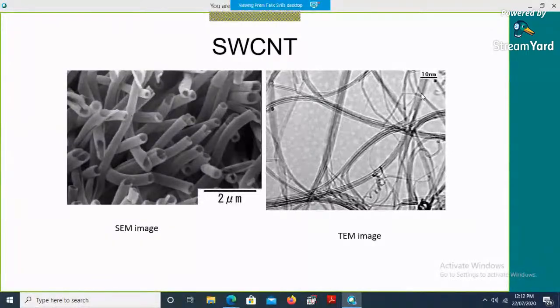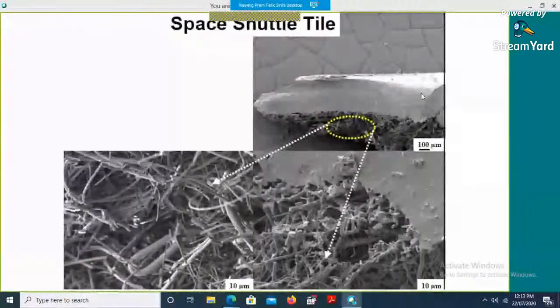So we have to make a judgment about what information we are looking for, and then use the appropriate technique. Apart from studying nanomaterials, bulk materials also can be studied, say, for example, failure modes in materials. This is a typical application for scanning electron microscopy.